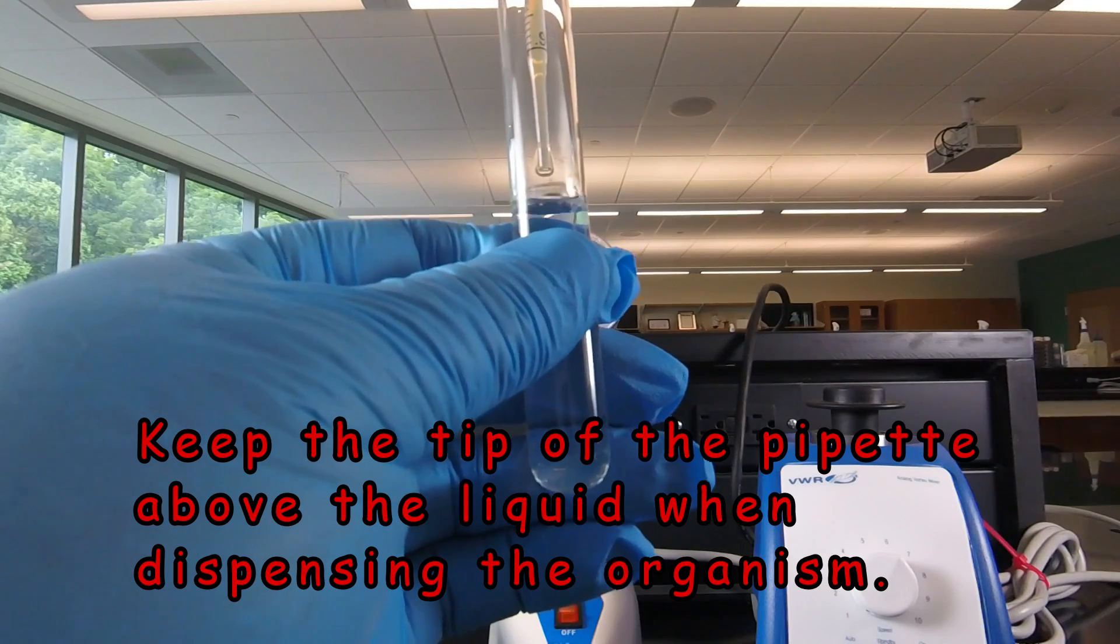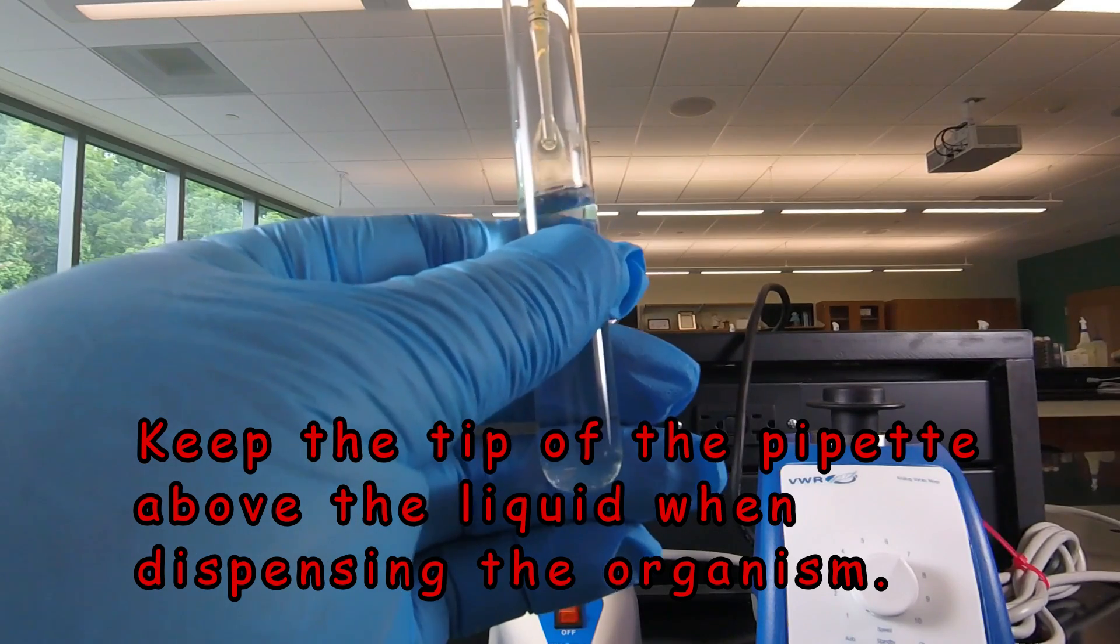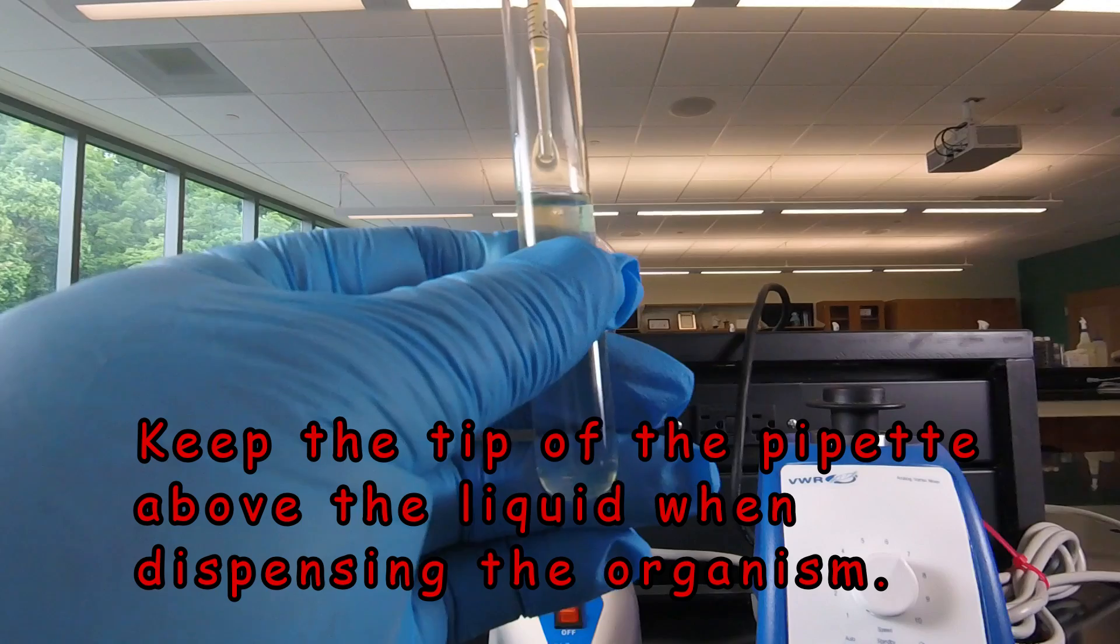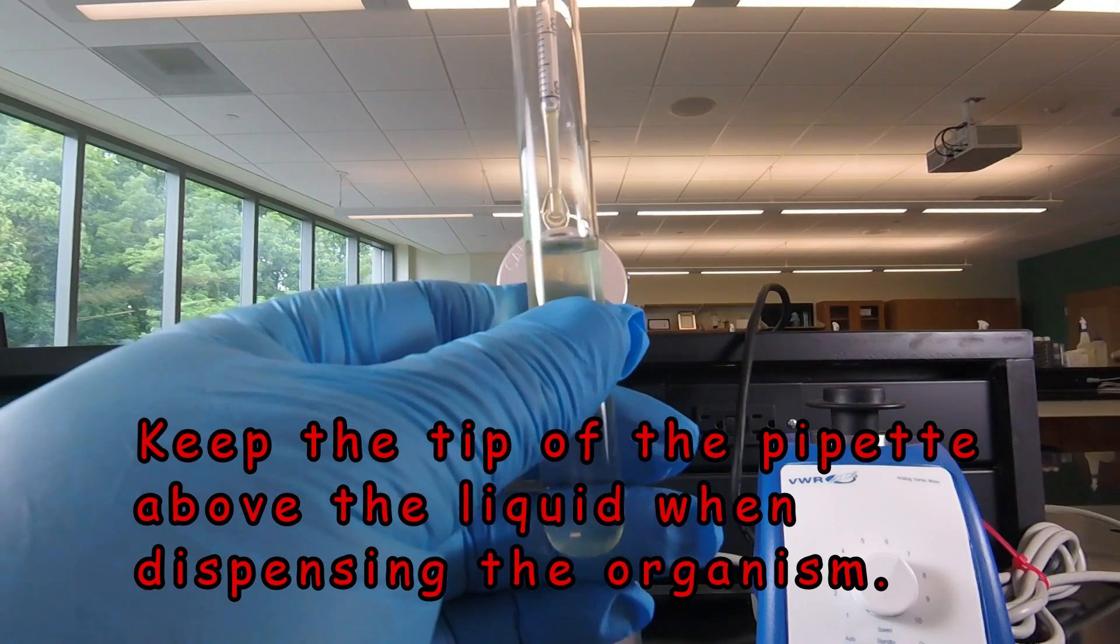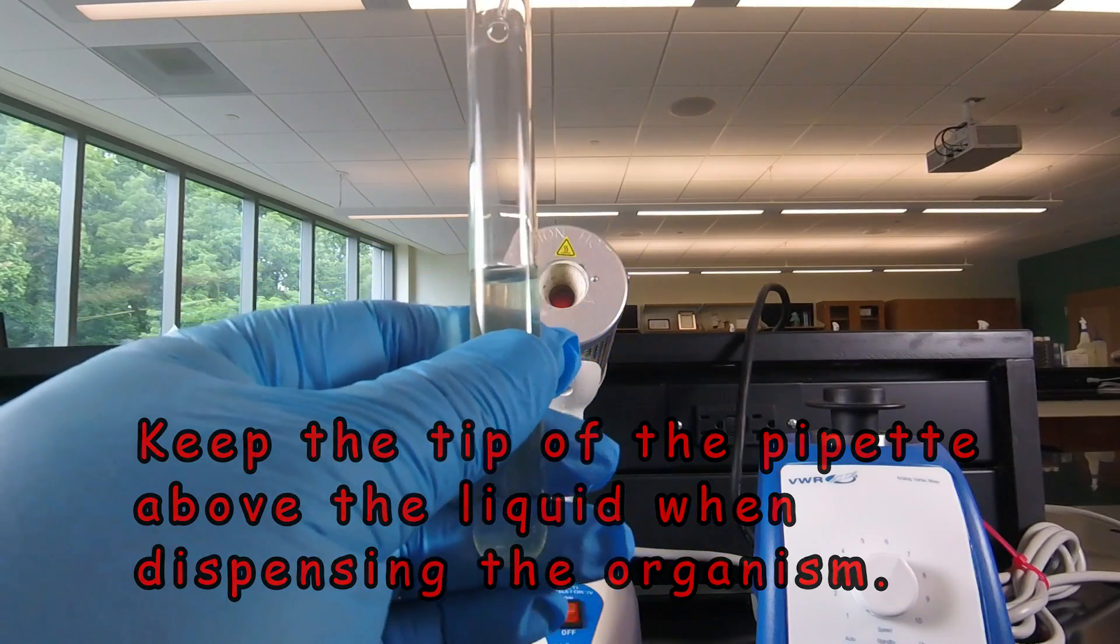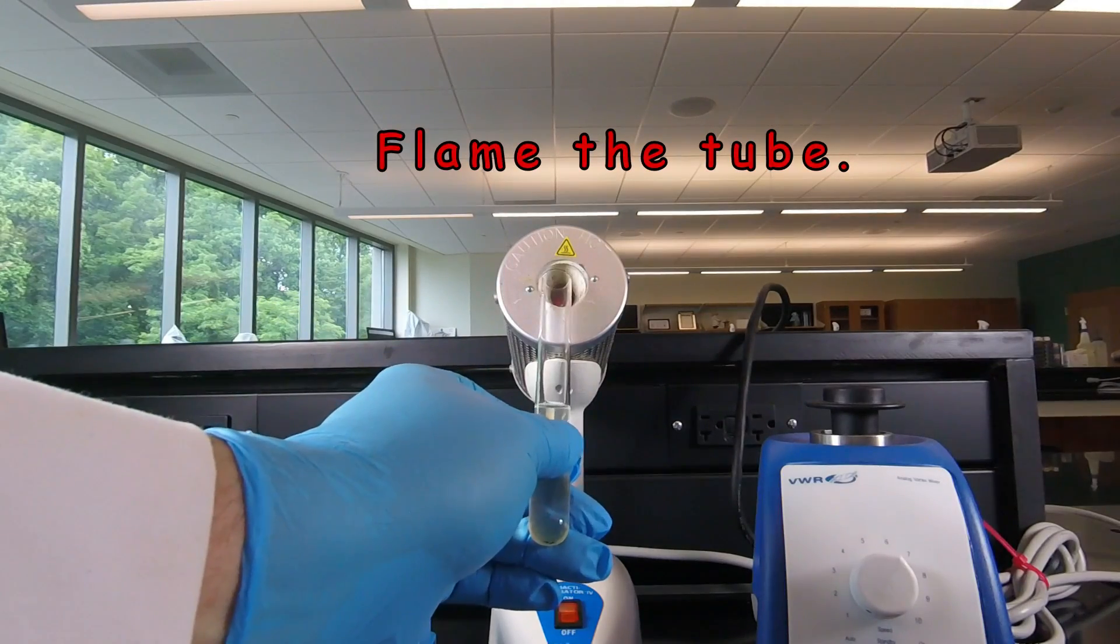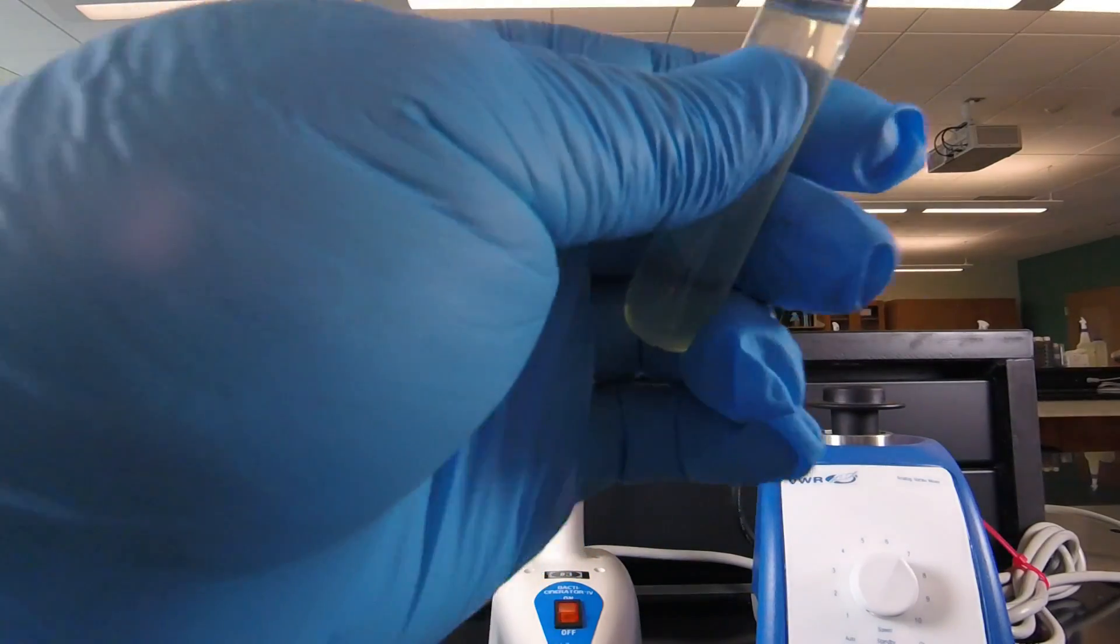So we're going to turn the knob upwards which lets the liquid flow out, watching the bottom of the pipet so that we can see when all the liquid has left. Then again we would flame the tube and put the cap back on.